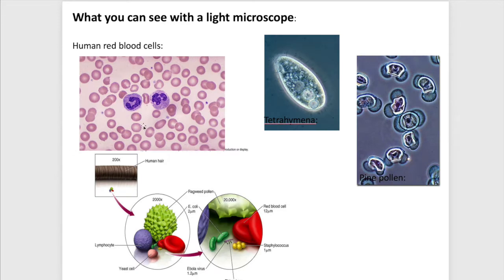And what can you see with the microscope? When you look at human blood here, I can see that there are a bunch of cells. And before the microscope, these cells, they're too small. You can't see that they're cells in blood. It just looks like a bunch of red stuff here. And so as soon as the microscope came about, people began to be aware that blood was actually made out of these individual components called cells, and that there was not one cell. There were several cell types. There's a little round one called red blood cells. There's other classes of cells, and these are called white blood cells. And there are a number of cell types here that without the microscope, you're completely unaware of.